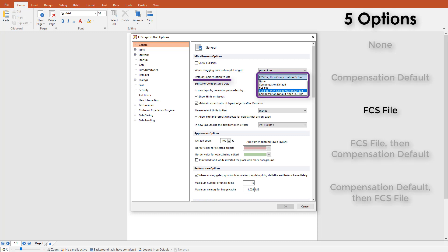The third option is FCS file. FCS Express will only read the FCS file's header. If a matrix is written at the time of acquisition, it will be read and applied to plots. Also, it will change to each respective data file's matrix when changing data displayed in plots or batch processing.